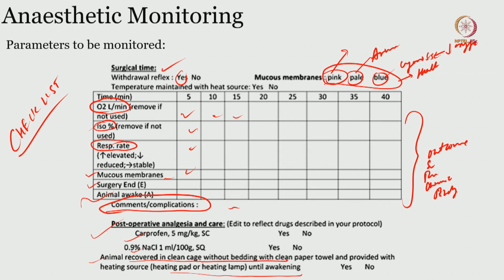important, because you are trying to look at the huge anesthetic responsibility, and there is a surgical responsibility going on. You need to set up the entire apparatus. So, I would strongly recommend that you have a checklist, have a written protocol stuck on your lab wall, wherein you know every step of what you are using until it becomes automatic for you.